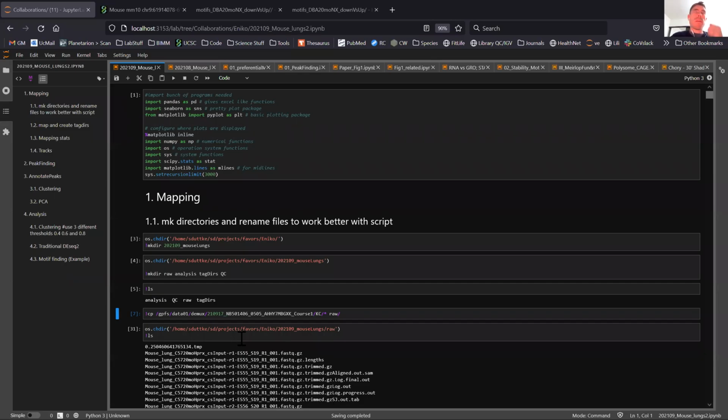Hey everyone, the first data are available, the second lane is running. And so in order for us to look at our data, I thought to briefly record a tutorial of how I analyzed Kelly's data. The idea, of course, of this tutorial is I cannot get everyone up to speed. You all have different backgrounds, but I think with the help of a bioinformatician who might set up Jupyter Notebook, as well as this notebook for you to edit, you might be able to get a quick handle on your data.